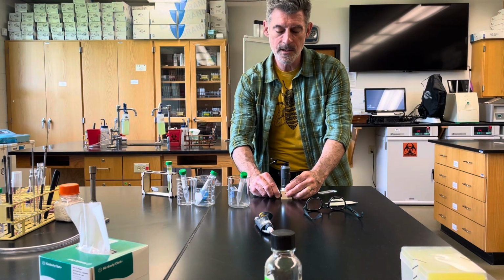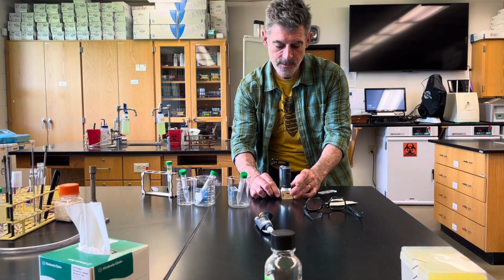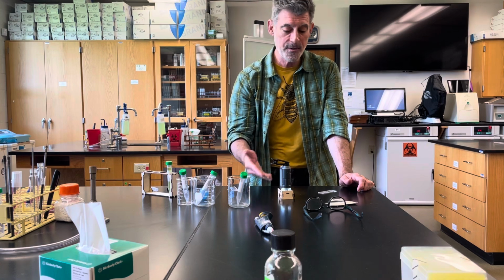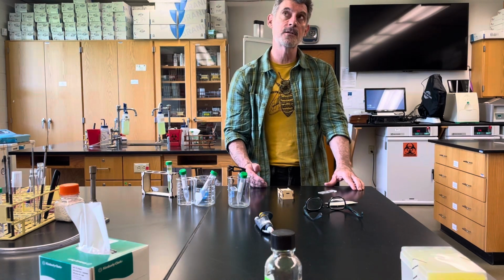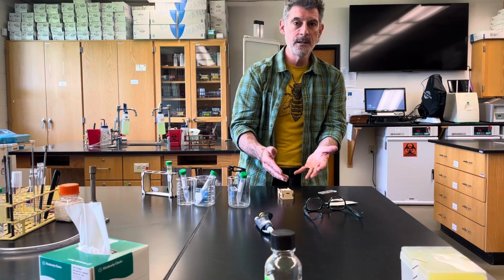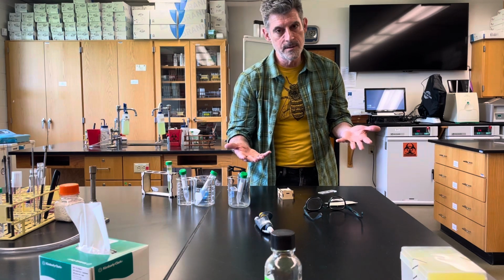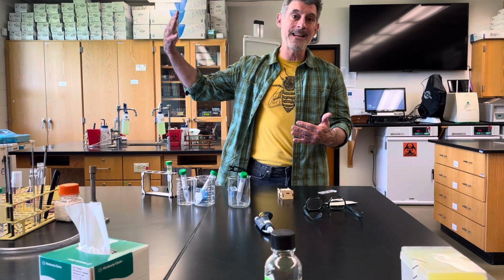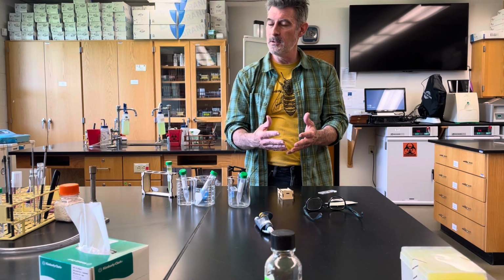So you're going to need to be able to adjust that. So we put these little knobs on here. It's very tiny, so it's really tricky to use at first, but you should get the hang of it after the first couple times of using it. Your first experiment is just with yeast cells, and that's almost intended for you just to get used to using the scope and using the base and counting some cells. Those cells don't move at all. They're just sitting there. So it's a lot easier to do that one. This one with the algae is like the next step, the next level up. So you need to have a little bit better skills to be able to do this one.